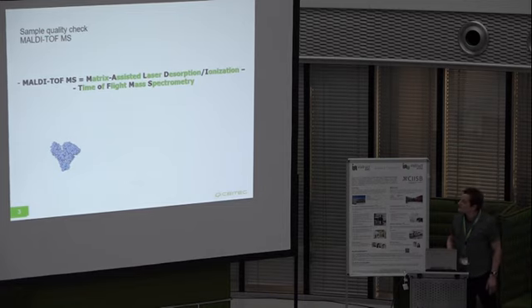In contrast to the name of the method, making the analysis is something very easy and can be accomplished in a few minutes. If you have your protein molecule and you want to determine its molecular weight, you simply mix it with an excess of a so-called matrix, which is usually a small molecule derived from benzoic, salicylic, or cinnamic acid, and you allow this mixture of your protein sample with the matrix to dry on a metallic support.